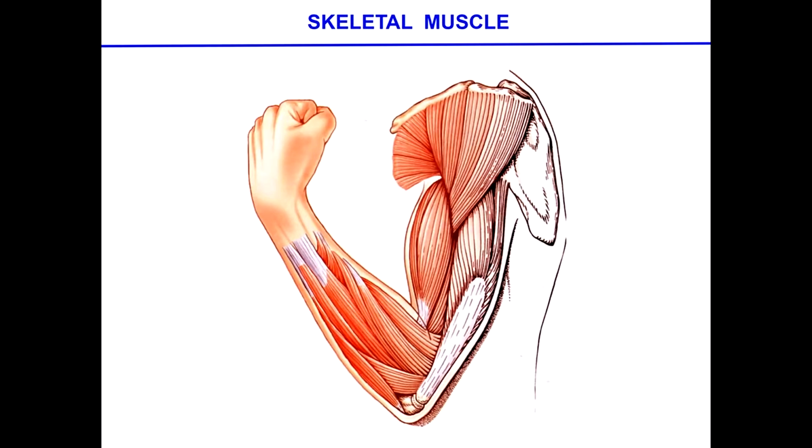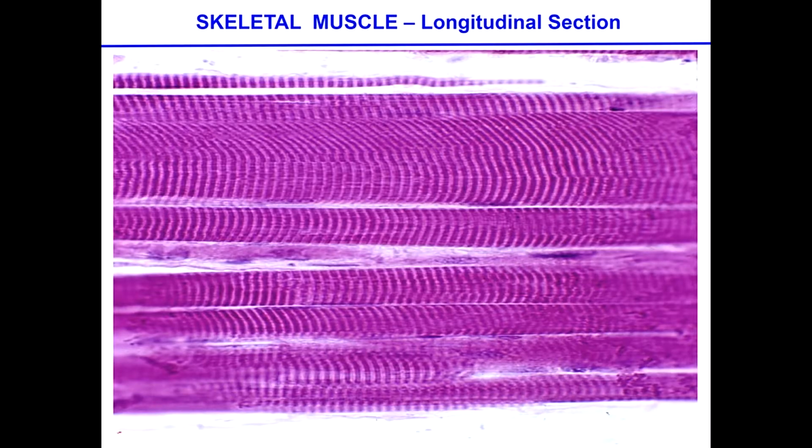Skeletal muscle has to do with the skeleton. All right? So you might actually see pictures in which portions of the tendons are participating in this. And if somebody shows you a picture of the famous Golgi tendon organ, you're going to be able to distinguish the existence of some portion of the tendon along with a portion of the muscle. All right? So remember, this is skeletal muscle. So it's very easy to tell right now which one this is. Homogeneous longitudinal fibers with typical striated segments and the nuclei in the periphery. So this is skeletal muscle.